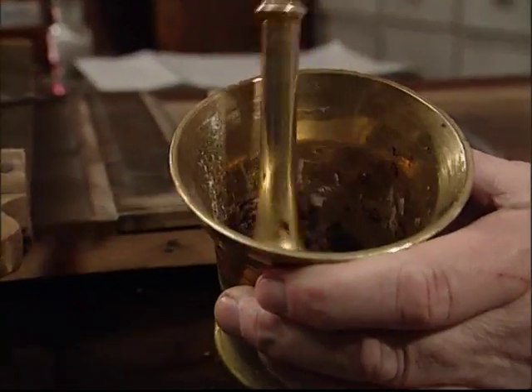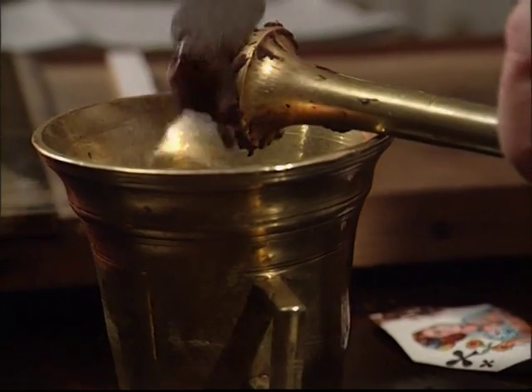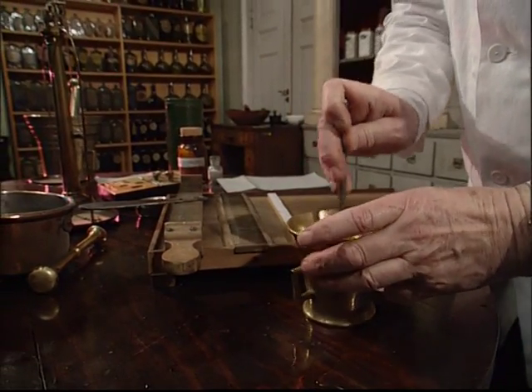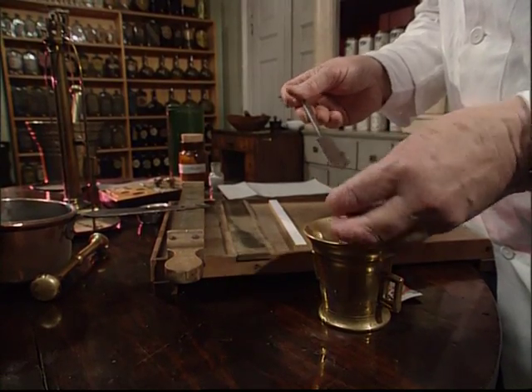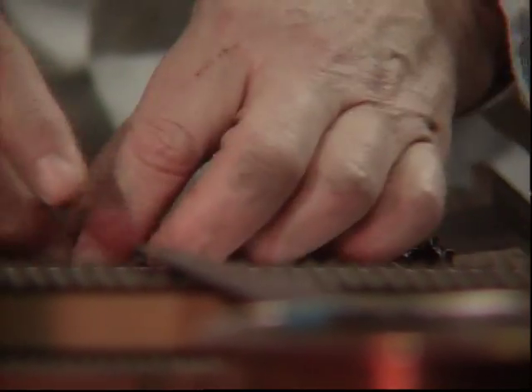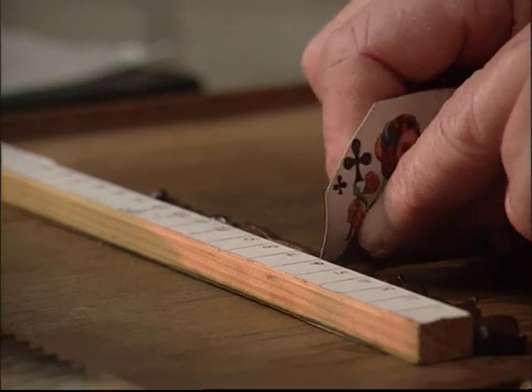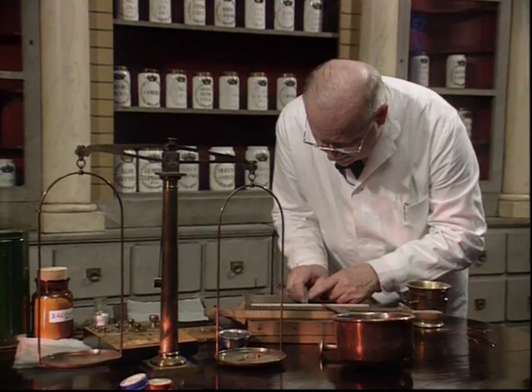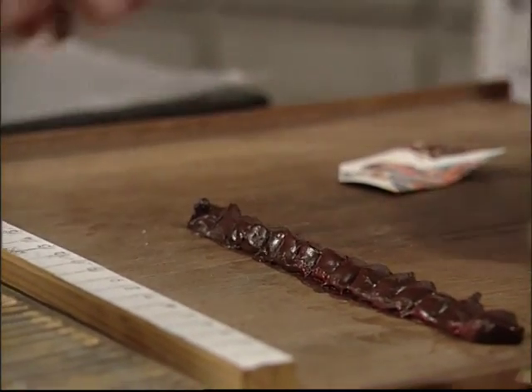Now it's all stuck together in one soft lump. So it's all gathered together as a whole. And now we'll make a sausage shape that we try to make as even a thickness as possible. So hopefully they'll all be a uniform size. 10, 11, 12, 13, 14 and 15. Now, to get them to look as if the pharmacist has made them.